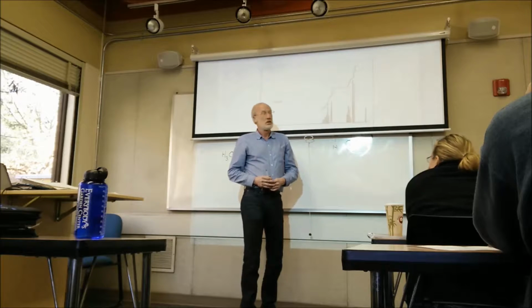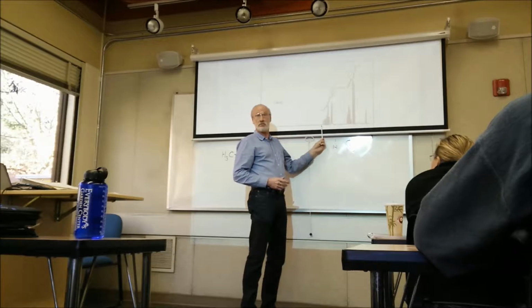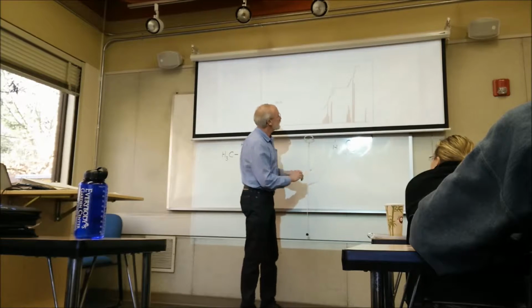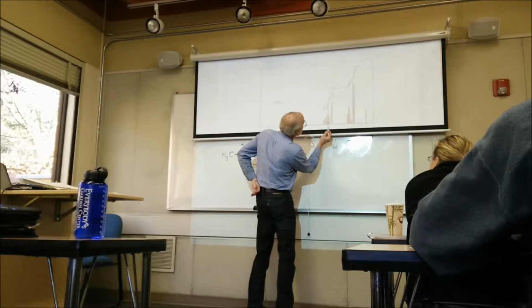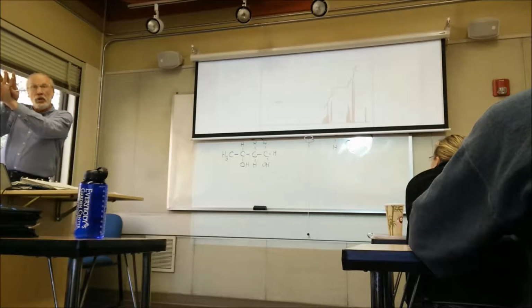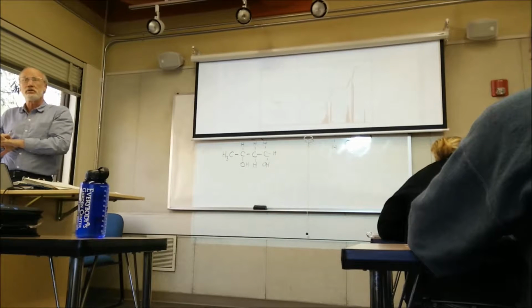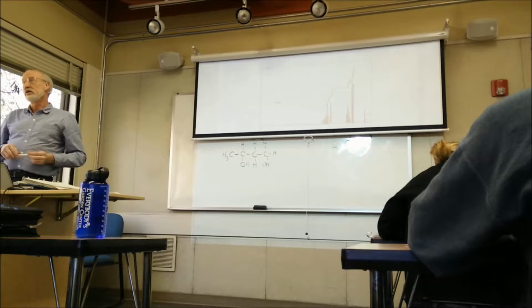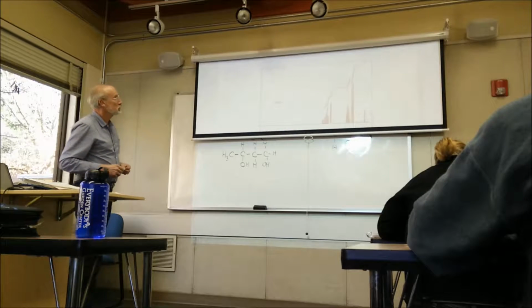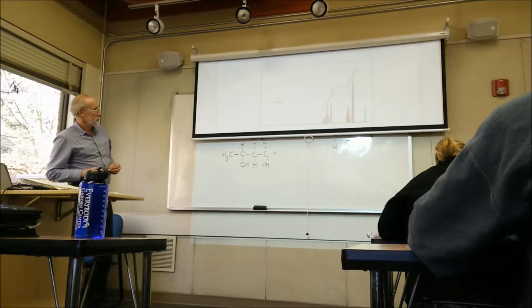symmetrically. So for the last one, this is a complex multiplet, and there are 2 ways that can arise. That is if the splittings are not simple, or if this is 2 peaks. For example, this might be a triplet, and this one's sitting right on top of a quartet. So if two different hydrogens have very similar chemical shifts, but when they get split, those two split peaks might sit right on top of each other and give you a complex multiplet. So that complex multiplet, you're looking at, from right to left, the second carbon, that hydrogen, and the fourth one, those two. Is that what you're saying the complex one is?